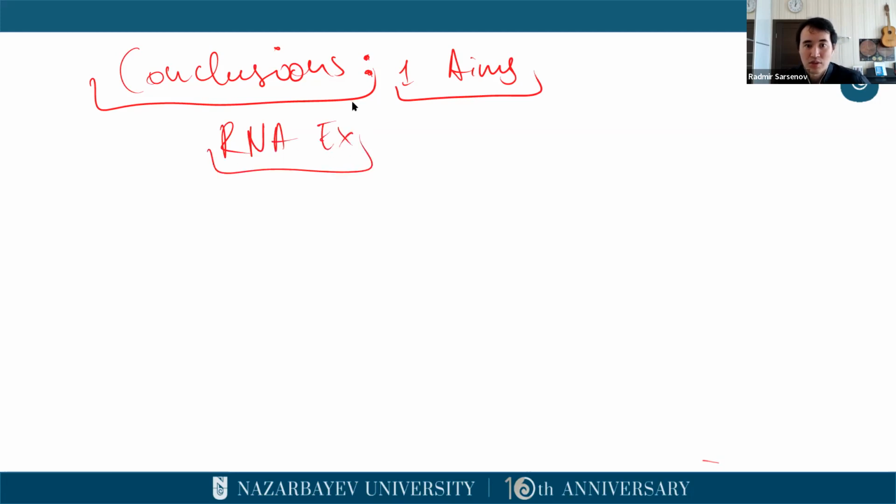Okay, so first one was RNA extraction. So you looked at the nanodrop and you don't receive any RNA, okay? If you don't receive any RNA, you just write it in conclusion. So the aim to achieve the RNA extraction was not fulfilled, and reference your discussion for why.